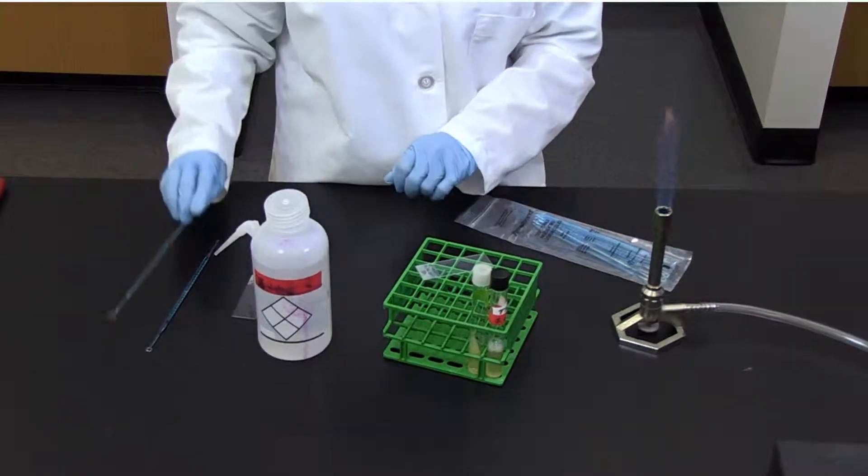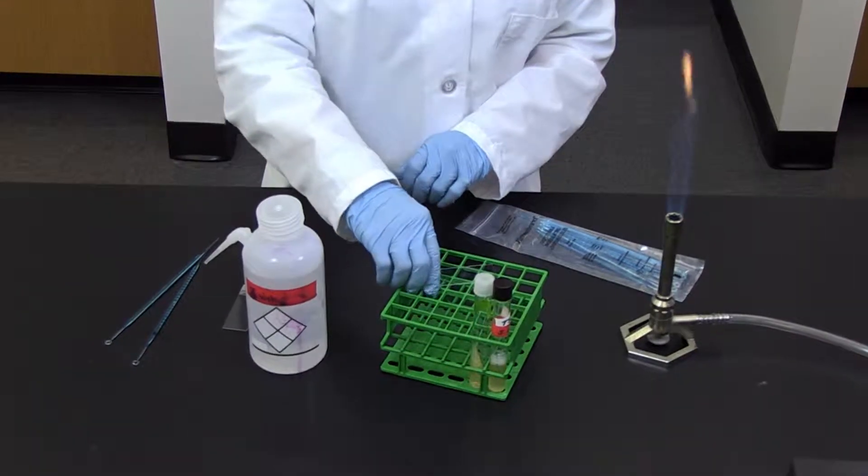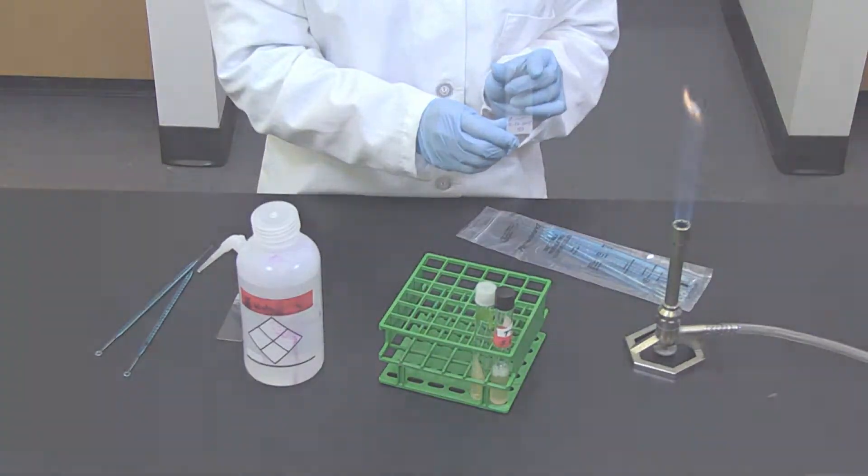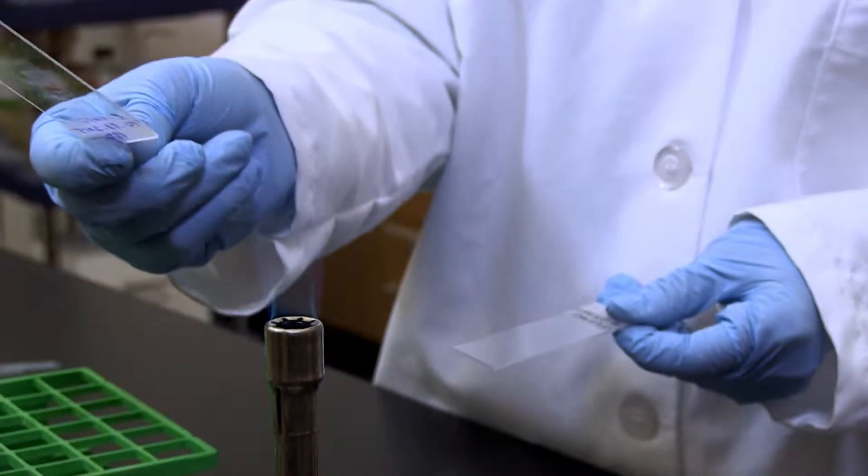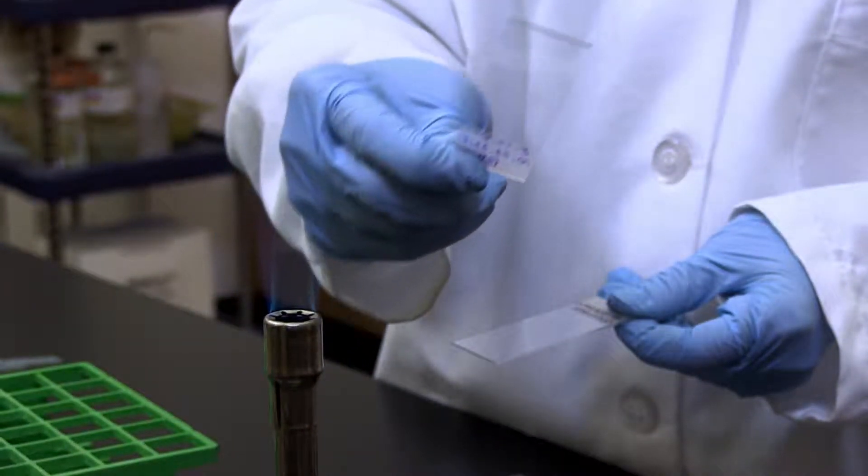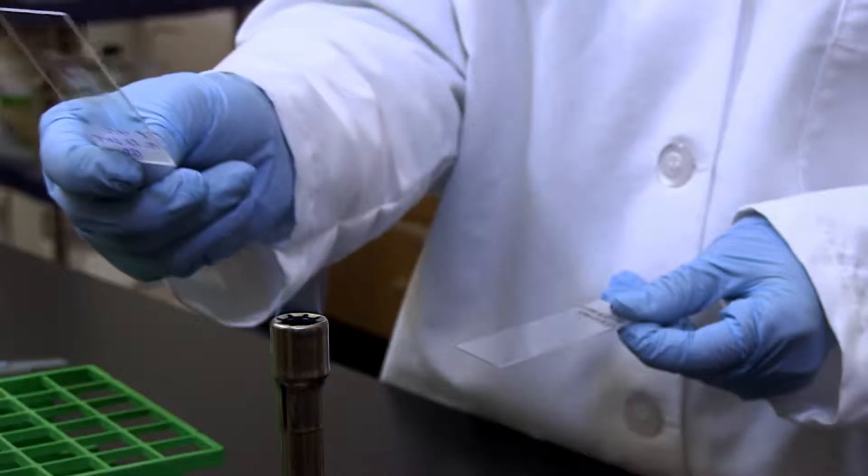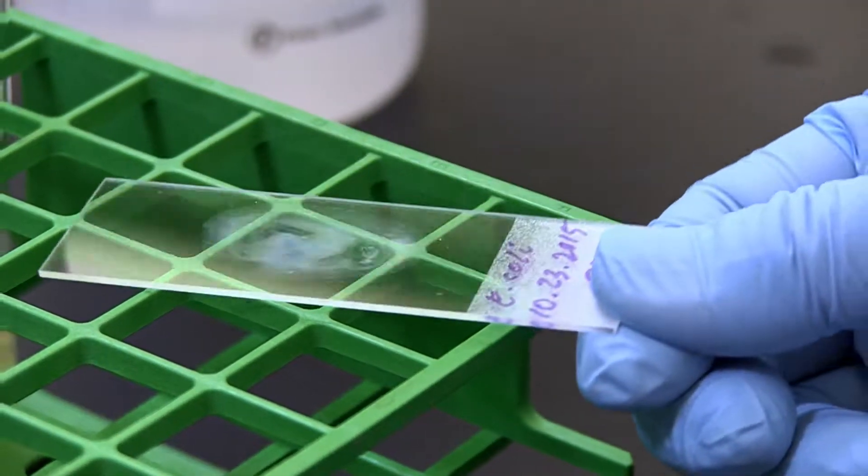Allow the smear to air dry completely. This should take 5 to 10 minutes. Finally, pass the slide with the smear on top through the flame of your Bunsen burner three to four times to heat fix the slide. The slide is now ready to use for staining.